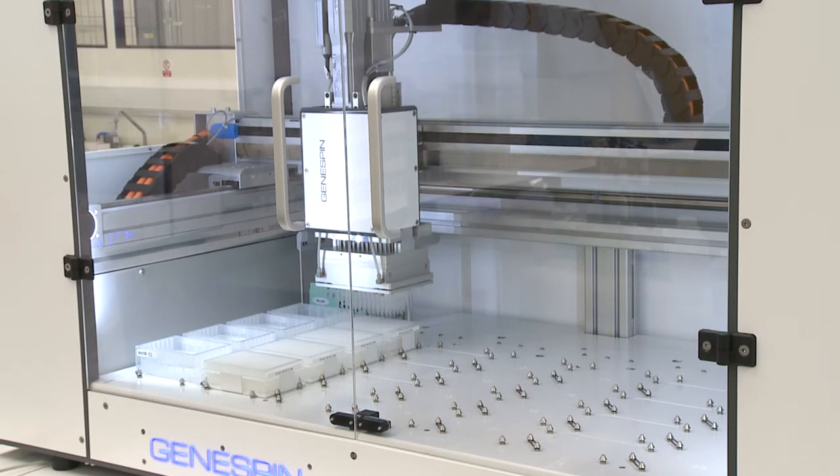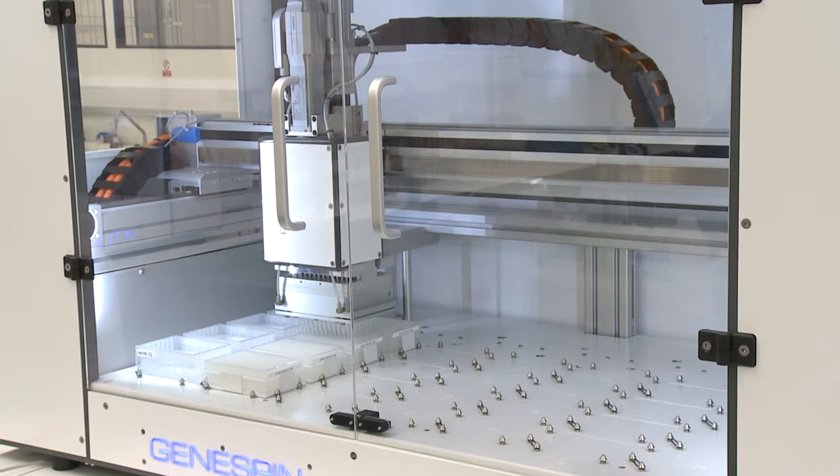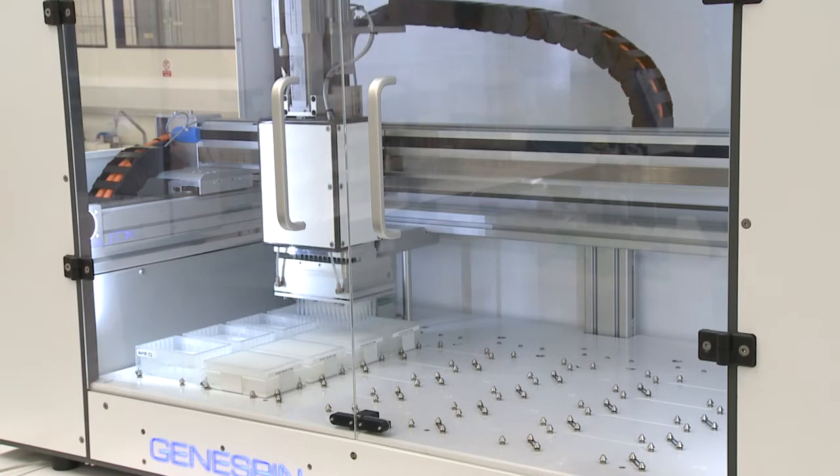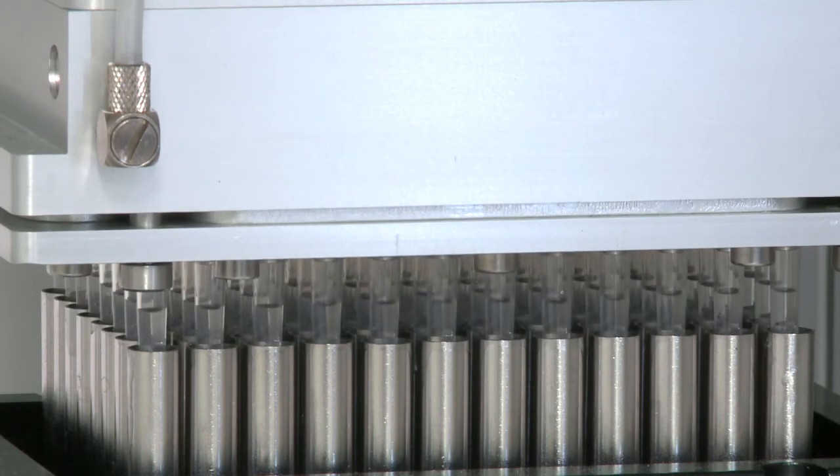The GeneSpin system is used widely in our labs for a huge array of species and project types in our genotyping service. The cost of consumables is reduced per extraction as the tips can be used up to about 40 times.